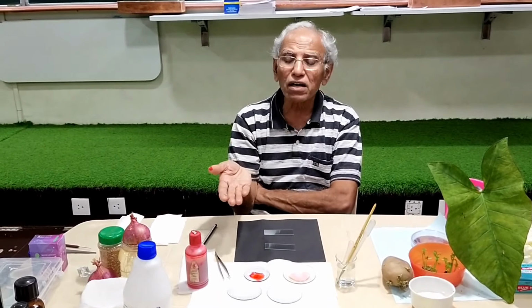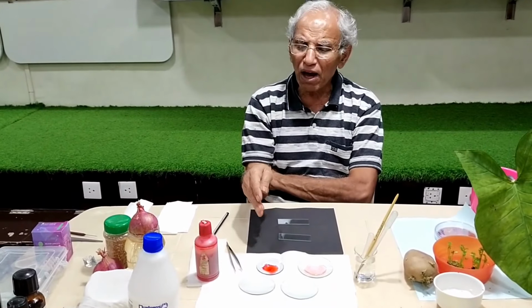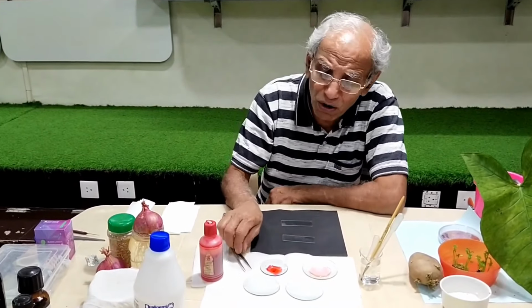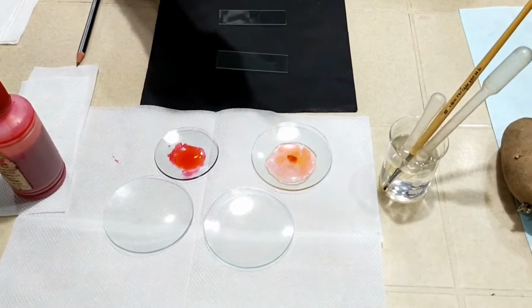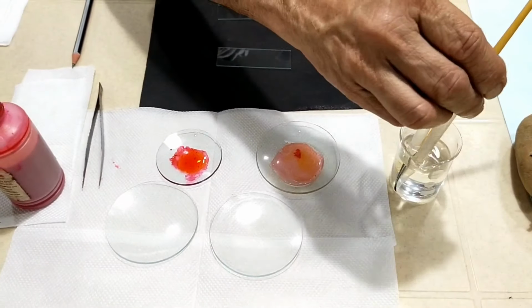So after staining, it's a matter of convenience and experience how much time to allow for the fixing. In my opinion, about 2 minutes is generally good enough, and then I'll put it for washing. What is this second step, washing? Washing is to remove the extra stain. Can you see a lot of extra stain being removed? In fact, I'm going to do the washing a few more times.